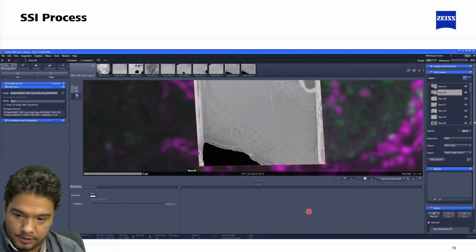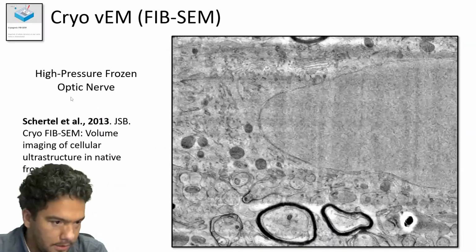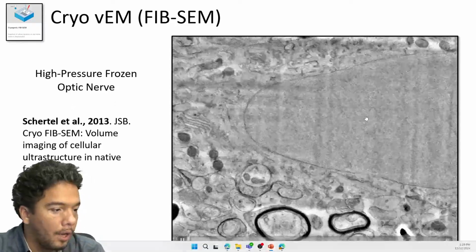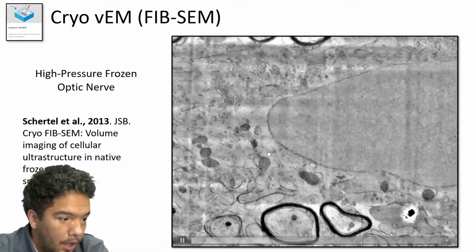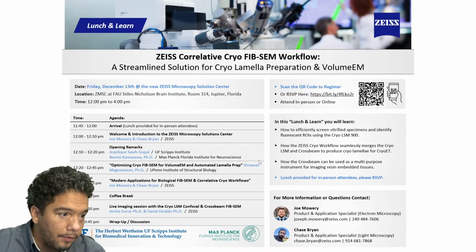That's pretty much what I have for today. This is how the final result of that kind of information looks like. We can navigate through our sample, through the detail of that sample.